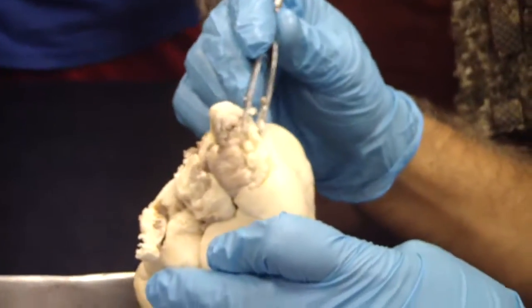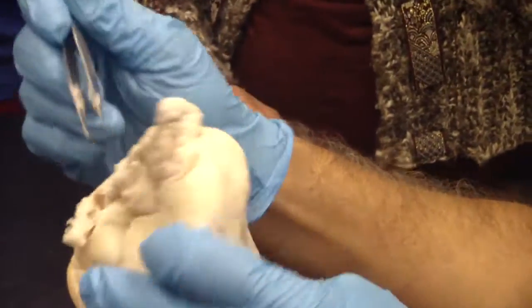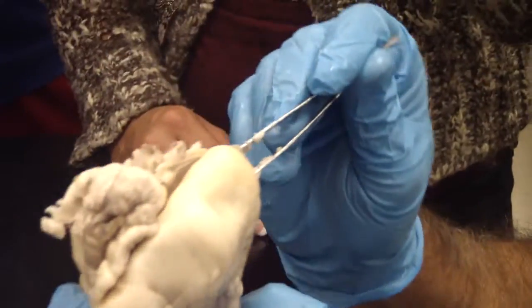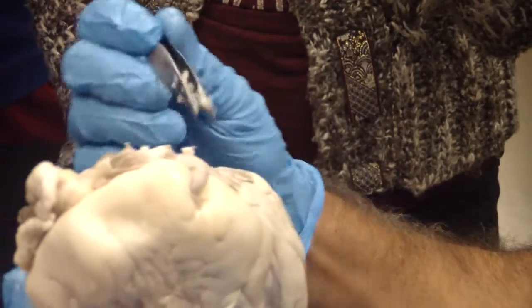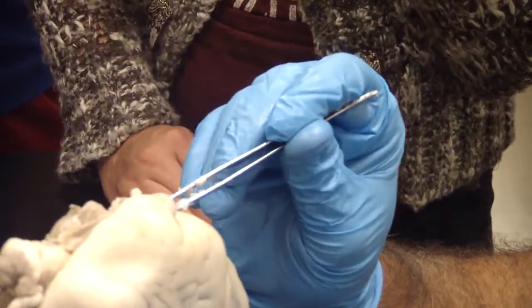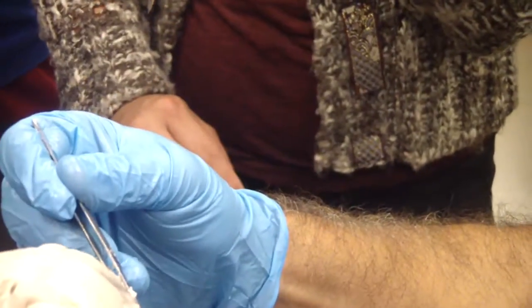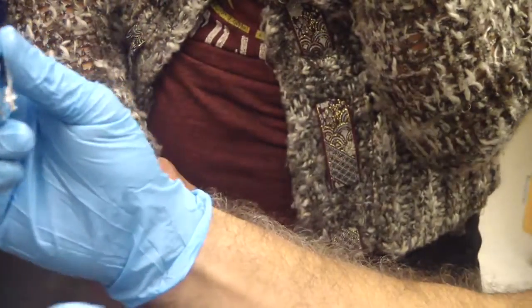So the right atrium or right auricle with the superior and inferior vena cava. The right ventricle, pulmonary trunk or pulmonary artery, doesn't matter. Pulmonary trunk or pulmonary artery right here. And then pulmonary veins with the left atrium or left auricle. Left ventricle. And then the aorta with the brachiocephalic. That's how much you can see from the outside.